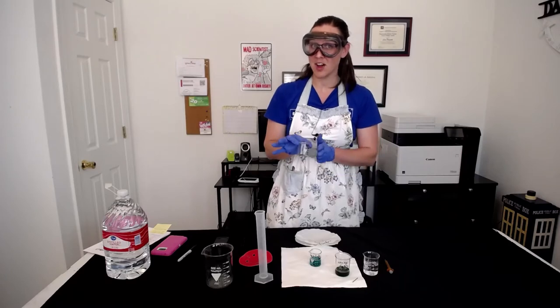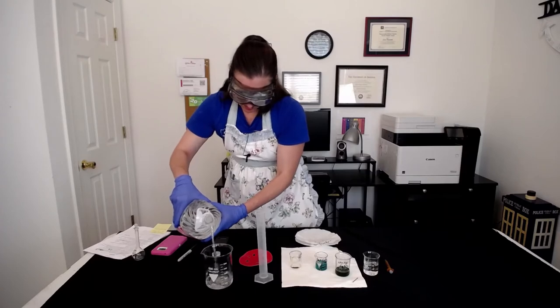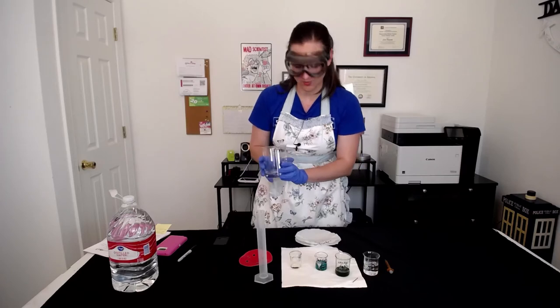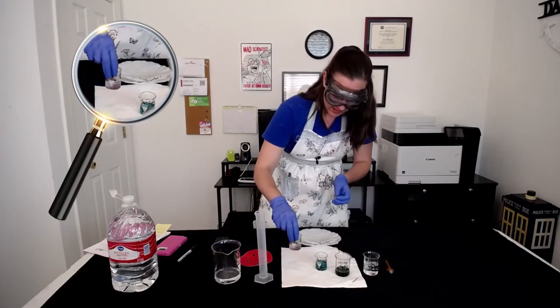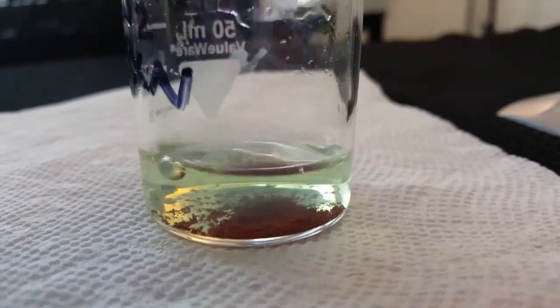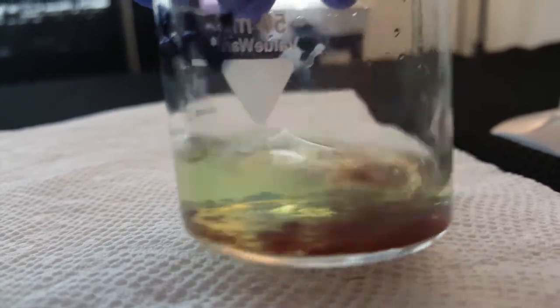Now that we have this nice accumulated copper at the bottom of our reaction vessel, we want to wash this copper before we put it onto our filter paper. Using deionized water, we want to pour about 15 milliliters of that over the top of our copper that's still inside the reaction vessel. Give it a nice little swirl to give it a good wash. After the wash, you can see that the DI water is slightly green because there's still some of that iron 2 or iron 3 chloride trapped amongst all of the copper solid. That's the reason why we're washing it — we don't want iron 2 or iron 3 chloride in our final product mass.